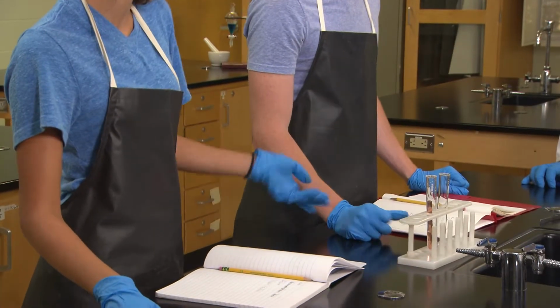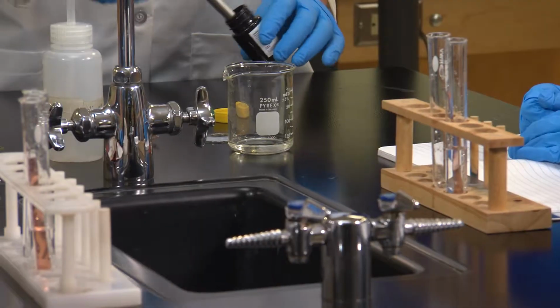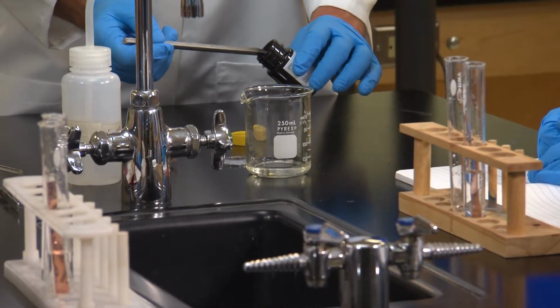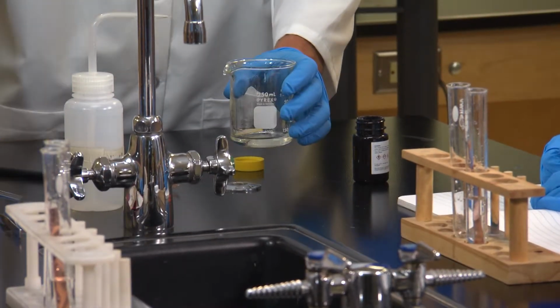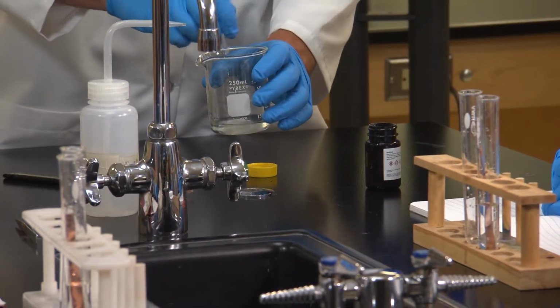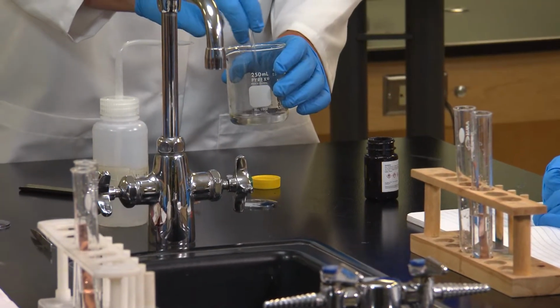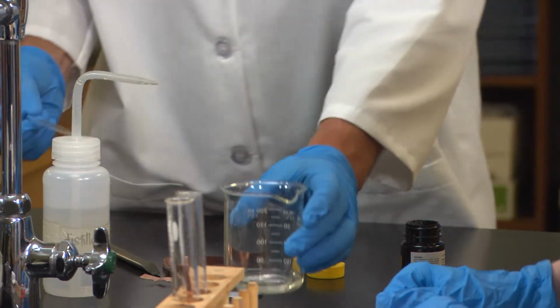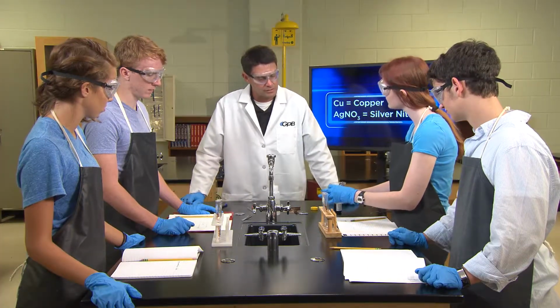See? Nothing. Okay, well, now what I'll do is use this spatula to take some solid silver nitrate, and I'm going to place it into this beaker that contains distilled water. Now, when I stir it, it's going to create an aqueous solution of silver nitrate. Now, what I would like you guys to do is pour some of that aqueous silver nitrate into the test tube and tell me what you observe.